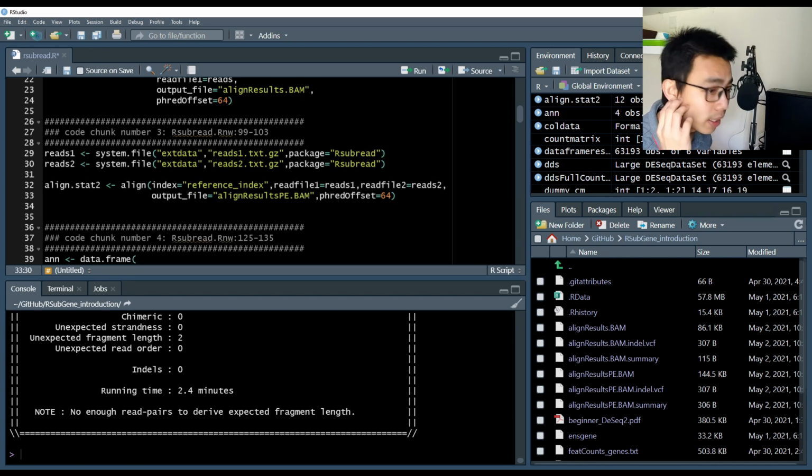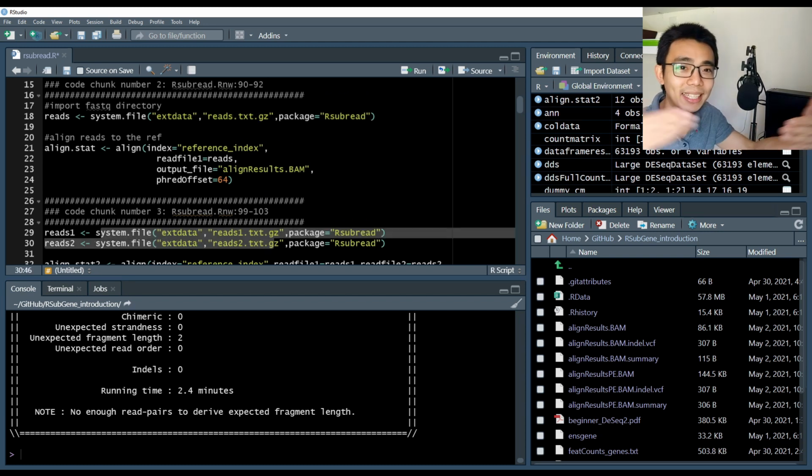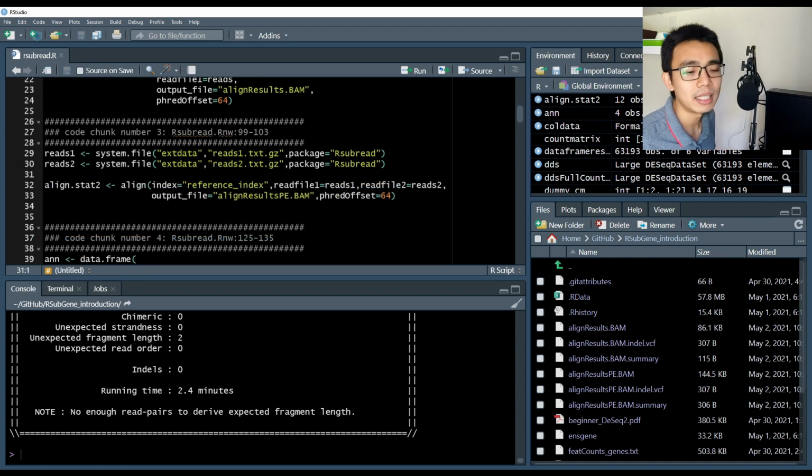What this basically means is that this is a single-end sequencing result, and this is a paired-end sequencing result. What I usually tell people is that if you are very familiar with the sample and you can get consistent results and you have enough replicate data, single-end sequencing is usually fine. But if you're doing anything new that you don't really understand or you've never done before, paired-end generates a little more peace of mind, as you'll be able to cover more coverage of your genome.